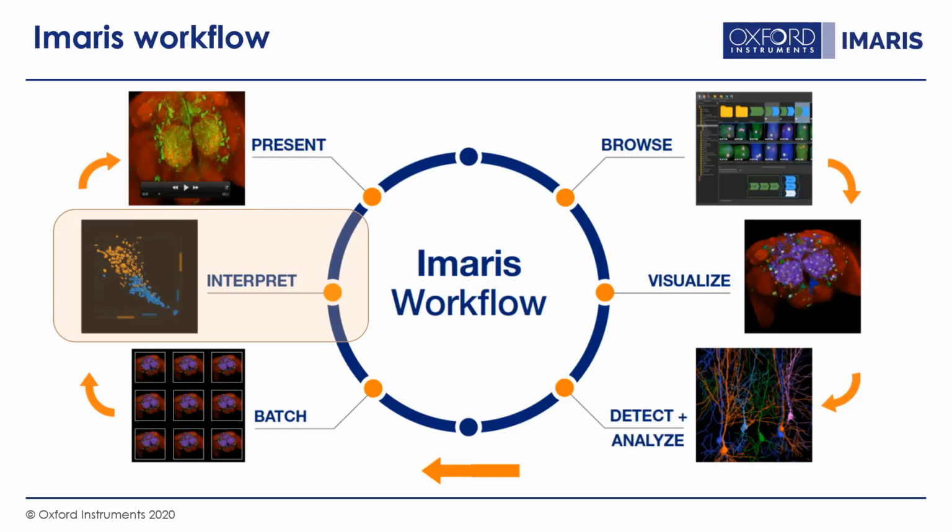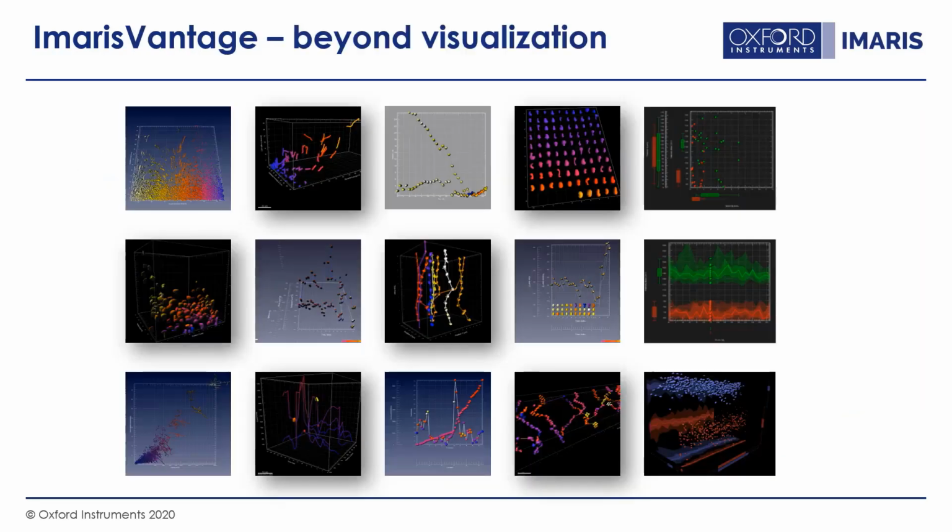In the past webinars, we focused on the visualization, detection and analysis of objects. Vantage is towards the end of the Imaris workflow, as it allows the interpretation of the data. You might have seen these graphs on our website, and you were wondering, how can I do this in Imaris? Well, during this webinar, you will learn how to create these graphs, but also how to interpret your data.